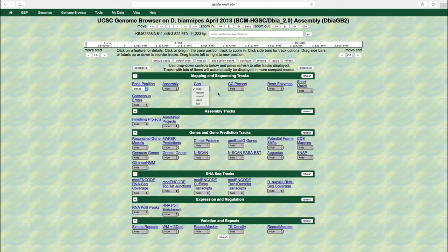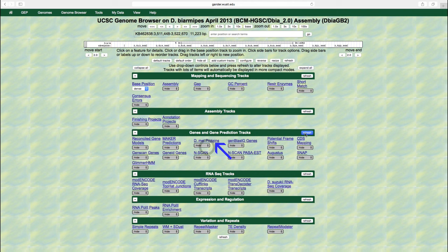To better understand how the display modes affect the genome browser image, we will experiment with the different display settings for the DML proteins track. Scroll down to the genes and gene prediction tracks category, change the display mode for the DML proteins track to hide, and then click on the refresh button. Hide means this particular track will not be shown at all.